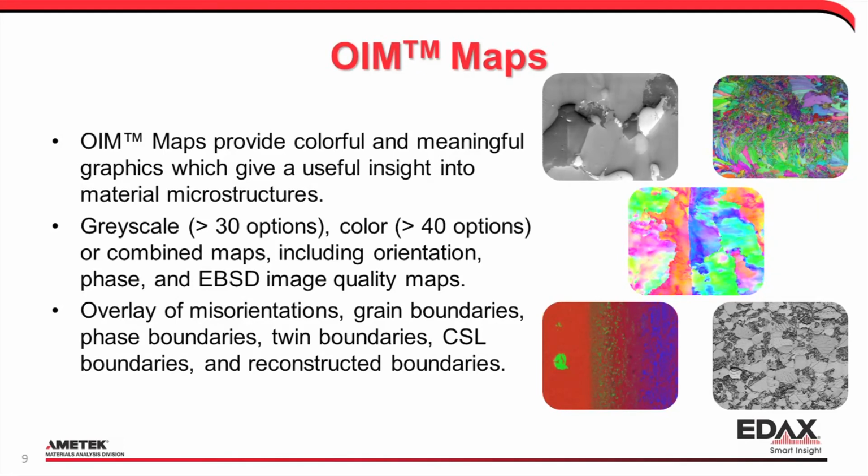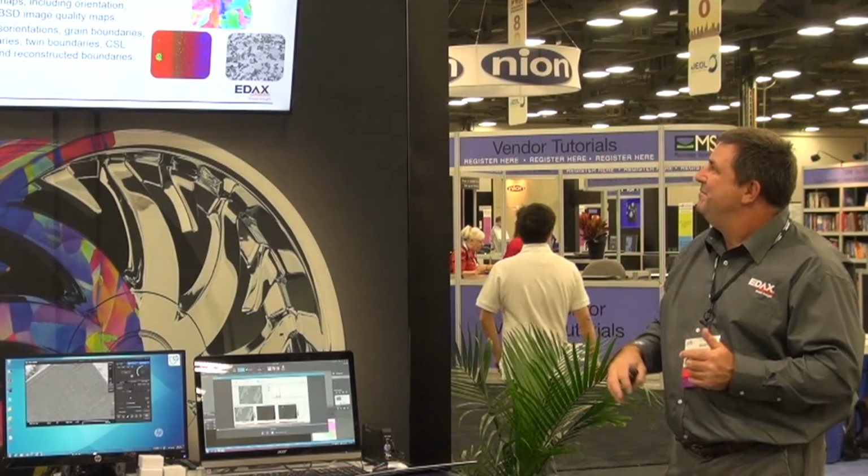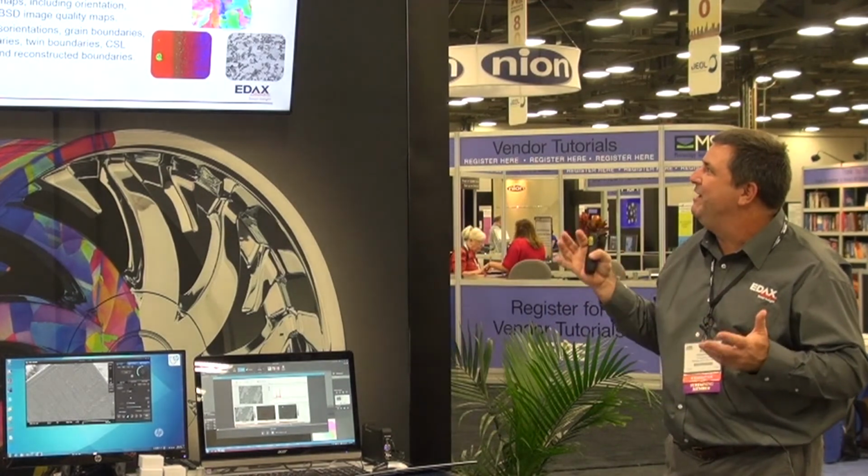First thing is they're very colorful. They're pretty. We love to put them up. You'll see they're all around our booth and superimposed on different things. Not only are they pretty though, they can provide meaningful information.